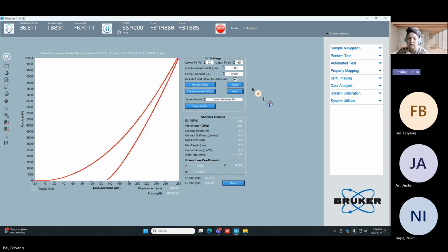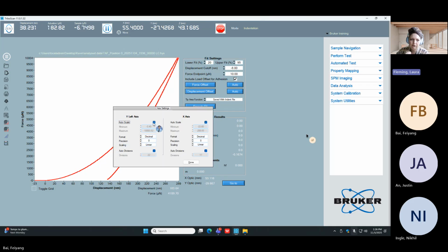However, we are a trust but verify kind of people, us scientists. So go ahead and double click in the center. And let's zoom back in on that 0 point. So similar values, -5 to 10 and -5 to 5.